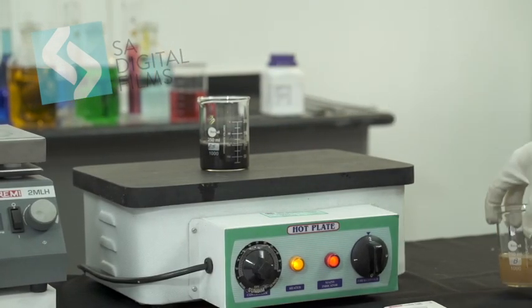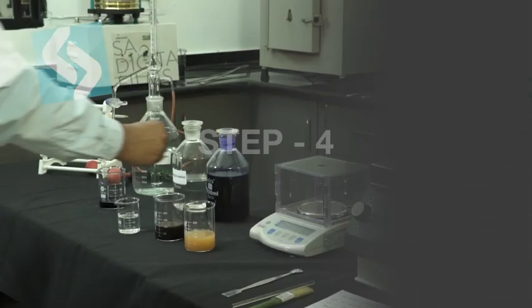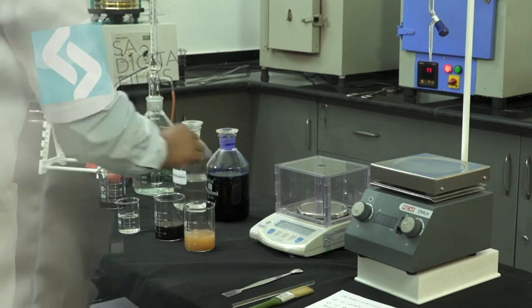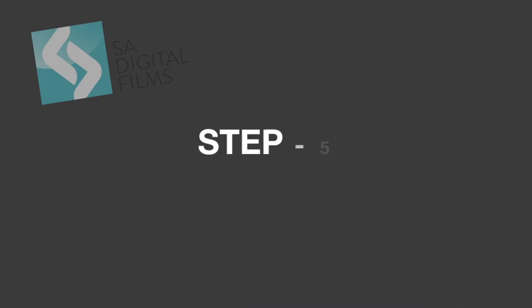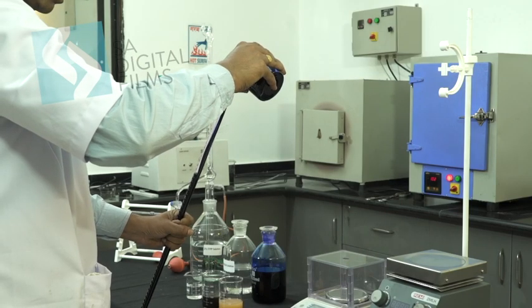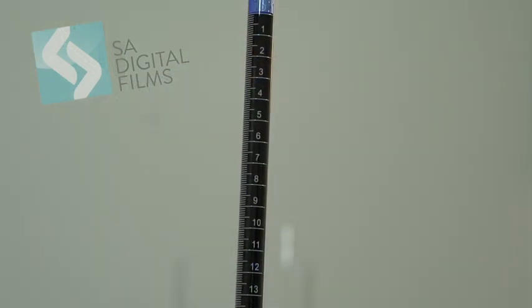Step 3. Remove from hot plate and cool. Add 2 ml of 5 normal H2SO4 solution. Step 4. Put the magnetic bar in the solution. Keep the beaker on magnetic stirrer and switch on. Step 5. Fill the burette with methylene blue solution 0.01 N and adjust the zero mark.